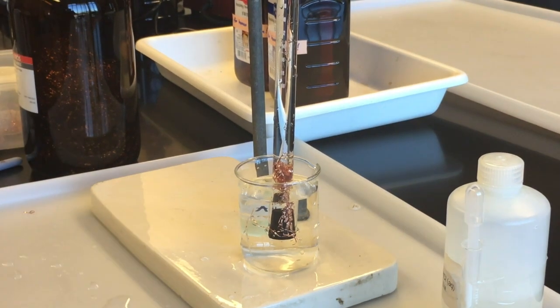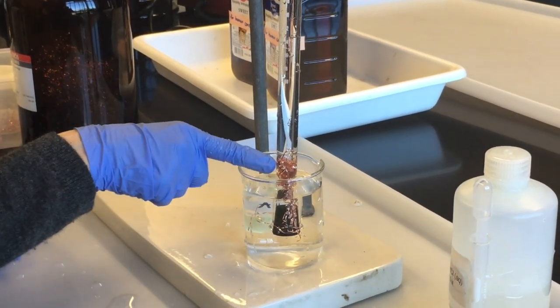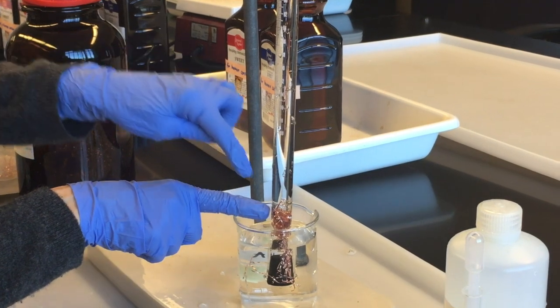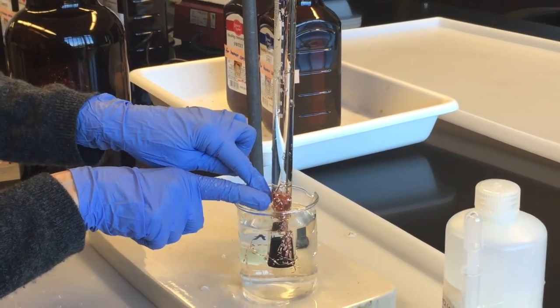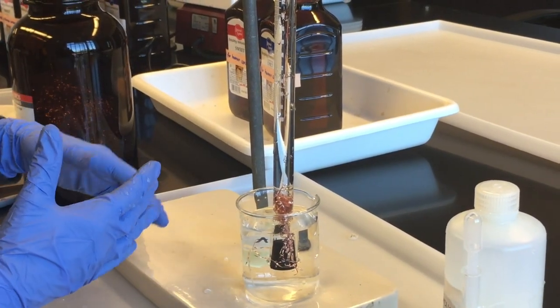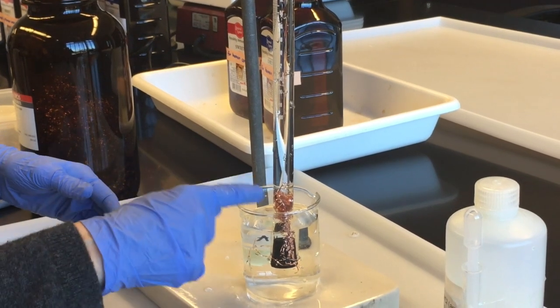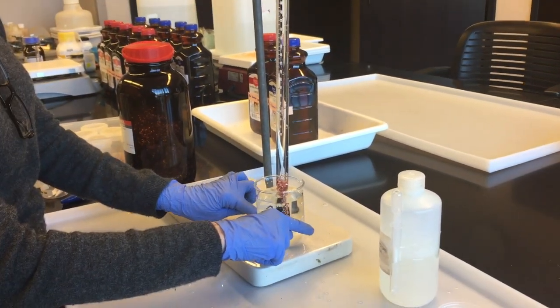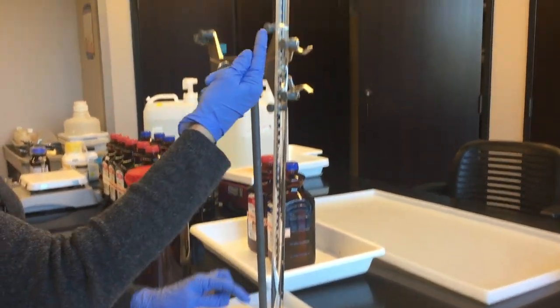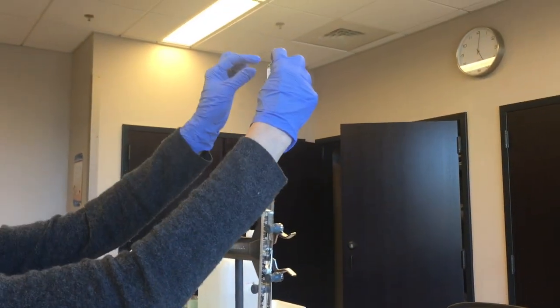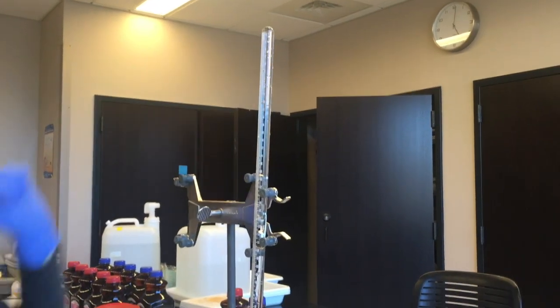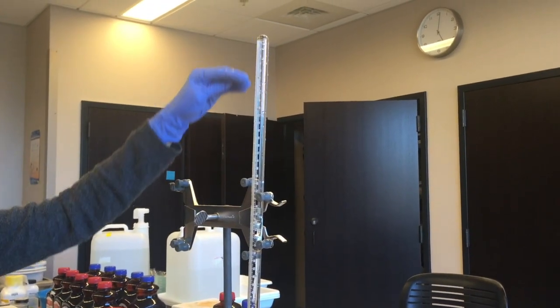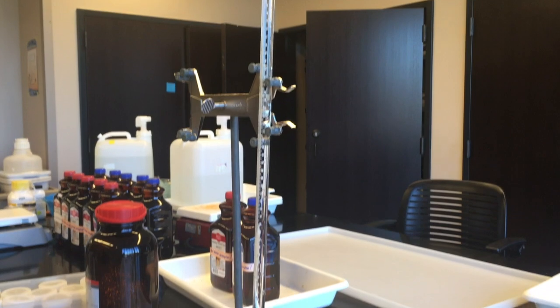So what we're hoping for is that as the hydrochloric acid moves down and hits the magnesium there'll be a chemical reaction and the product of that reaction is going to be hydrogen gas. And the hydrogen gas then does not escape out through the hole down here. What it does is it bubbles up and pushes up and will push down the water and the water will go out the hole at the bottom. And so we will be measuring that volume of hydrogen gas produced.